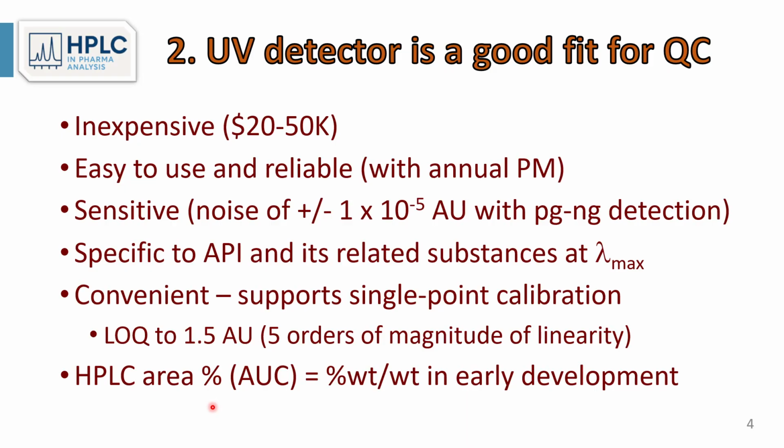In early drug development, the area under the curve, the HPLC area percentage, is generally regarded as equivalent to the weight percent.